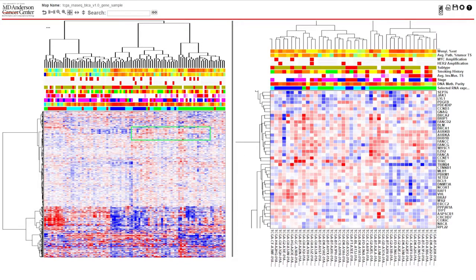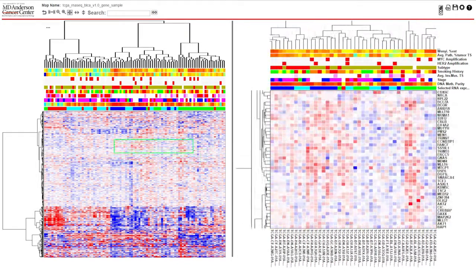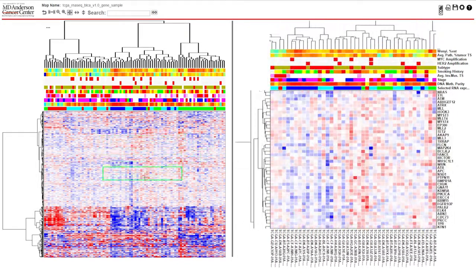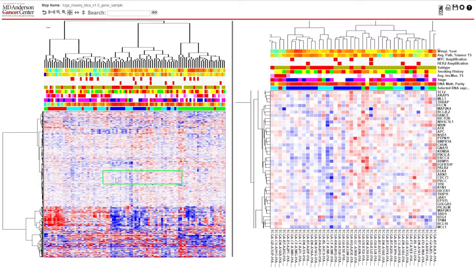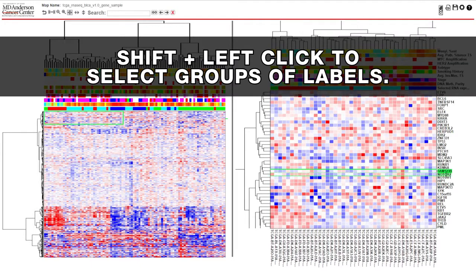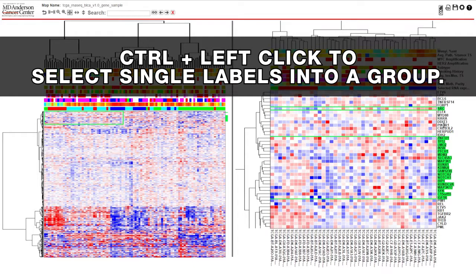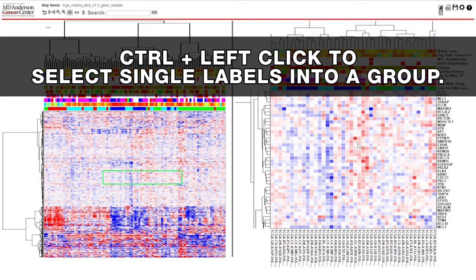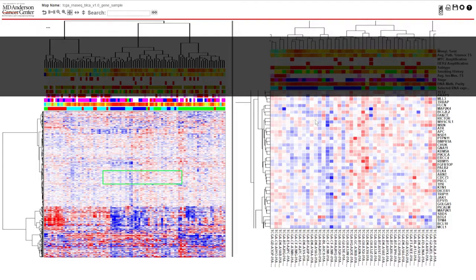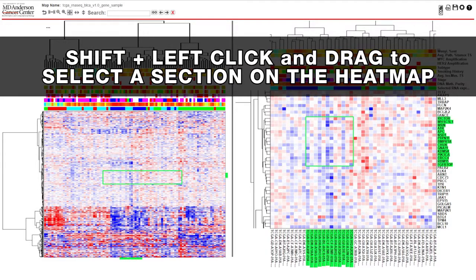Along with searching for individual labels, you have the ability to select multiple labels at once. In the detail view, you have a few different options for doing this. You can shift left-click to highlight multiple labels in a row, or control left-click to select individual labels in a group. You can also shift left-click drag within the summary window to select a row and column group.